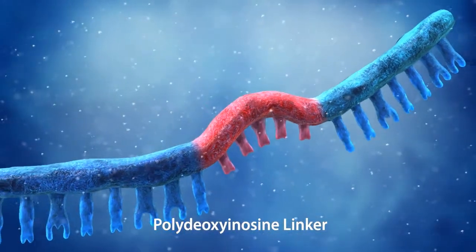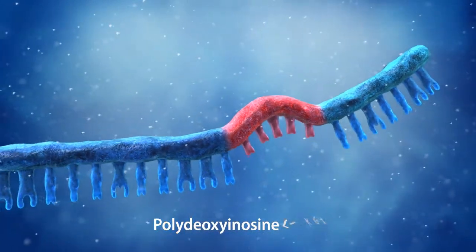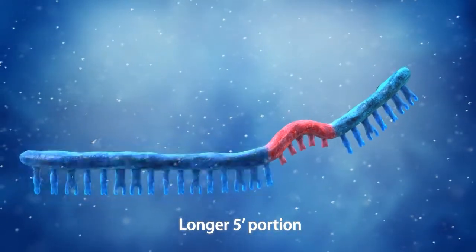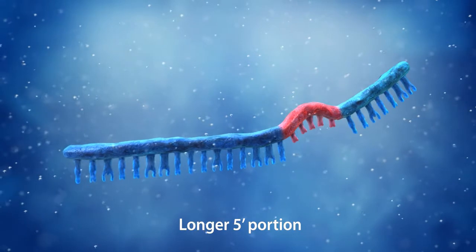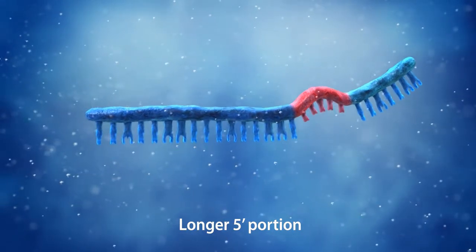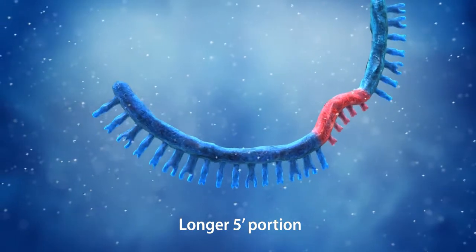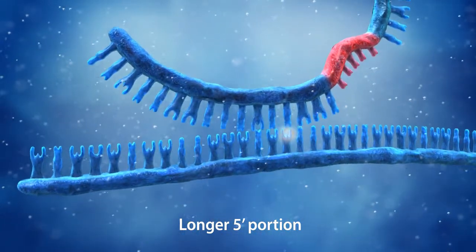Because the sequence of the five prime portion is approximately two times longer than the three prime portion, the five prime portion has a higher TM and will preferentially bind to the template DNA first during PCR. The five prime portion works as a stabilizer, initiating stable binding of the DPO primer.